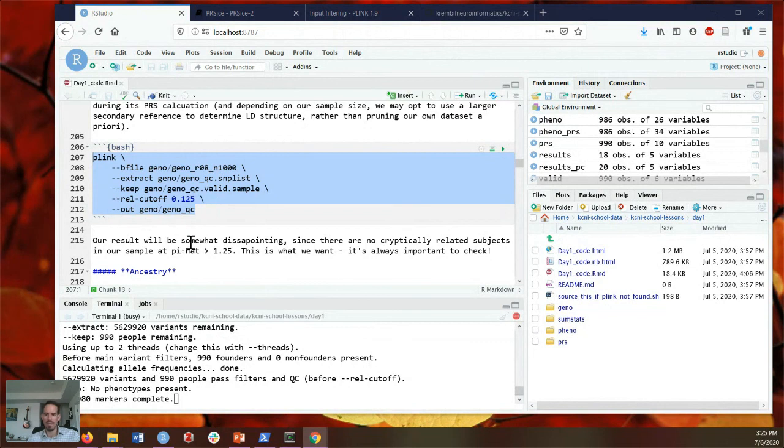It violates some of the independent assortment assumptions that we take for granted when looking at genetics at the population level and not incorporating family data. So we don't want individuals who have excess heterozygosity due to consanguineous relationships, and we definitely don't want to analyze a sample that's been contaminated with someone else's DNA and therefore just has more rare alleles than you might expect them to have, and therefore a bolstered amount of heterozygosity.